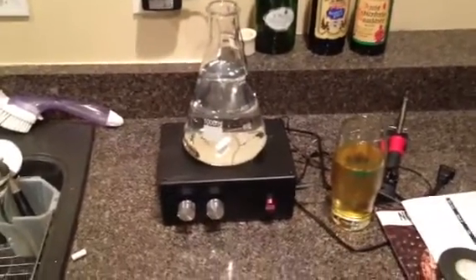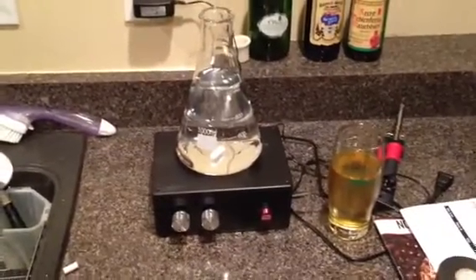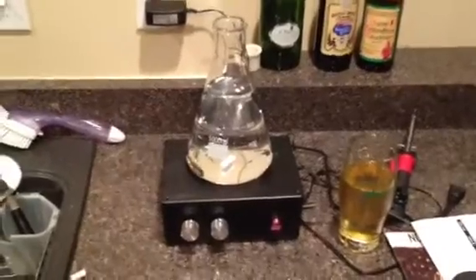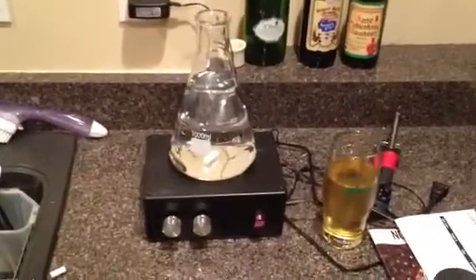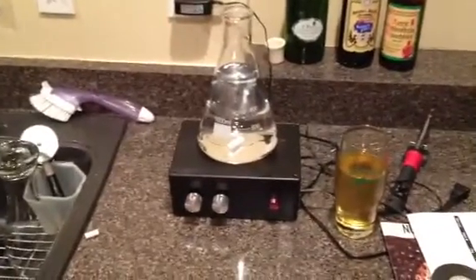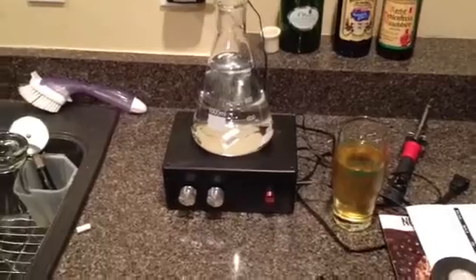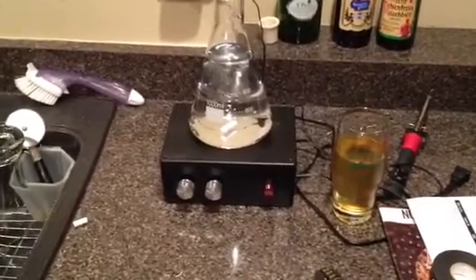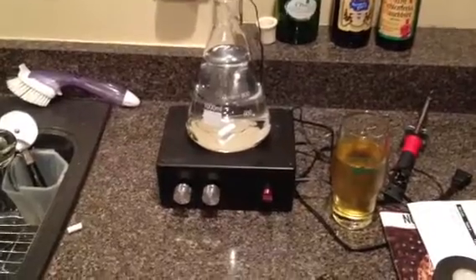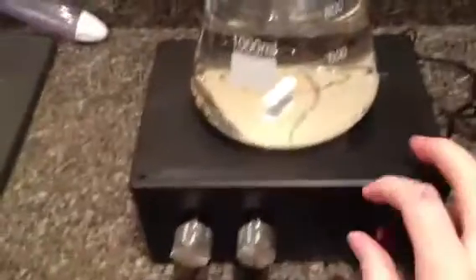Hey guys, I thought I'd fill you in on my latest Radio Shack build. Recently I've gotten into playing around with different yeast strains for my brewing applications. I've been looking online and I saw quite a bit on stir plates and building your own stir plates, so I thought I would give it a shot. I made this one for around 12 bucks with a few parts that I had from home and some components from Radio Shack.